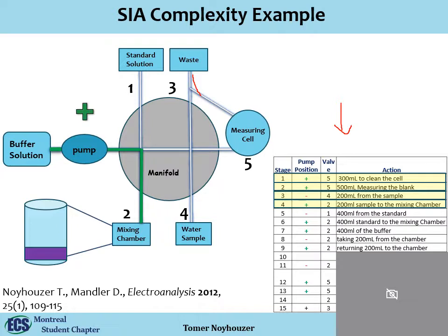Now, when you're doing these types of measurements, and I use the Tecan pump, you also need to check whether the pump has the same volume pushing and pulling. Because sometimes the pump will have a small difference. It could be a microliter or less, but it might be crucial for you. So you need to measure the amount of volume that is being pushed by the pump. Let's say you tell it, push 100 microliter. You need to measure that it is indeed 100 microliter. And this is very easy to do. You can just weigh the liquid, right?